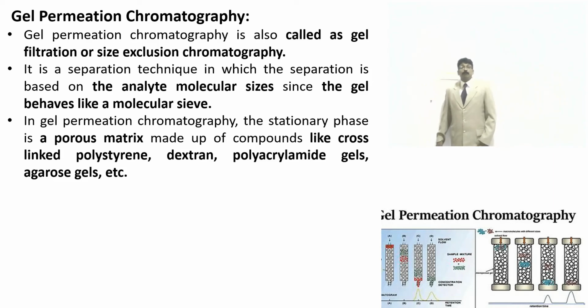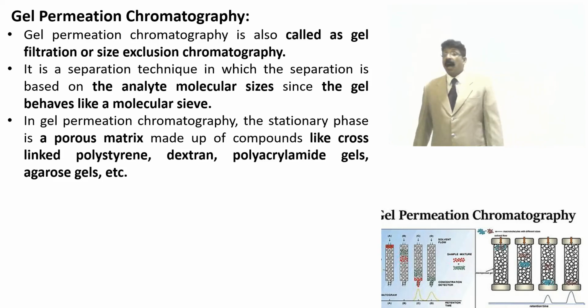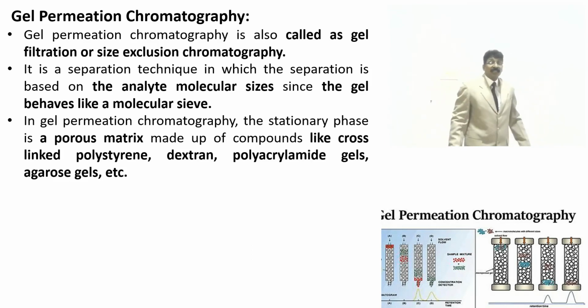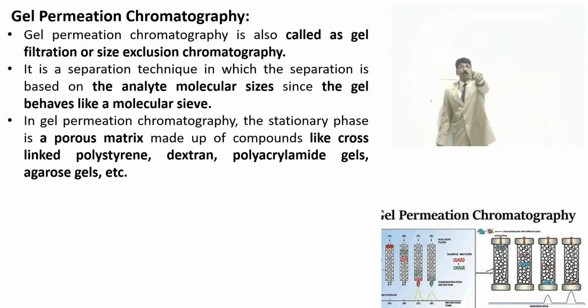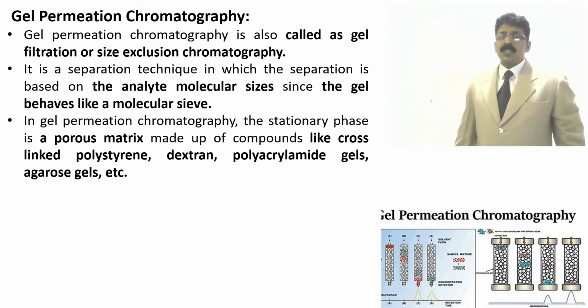There is polystyrene, dextran, polyacrylamide gels, agarose gels, etc. Agarose gels we have done in DNA fingerprinting technology, which I explained with a video in the last 3-4 classes, when I was telling about HPTLC and DNA fingerprinting. In that also we were using agarose gels for separating the DNA molecules.